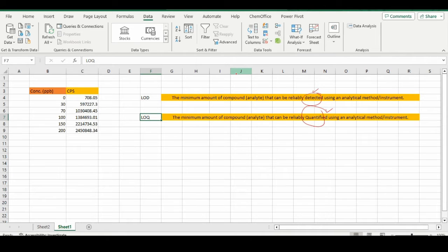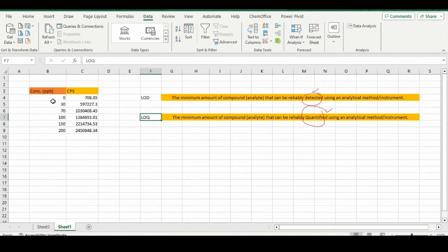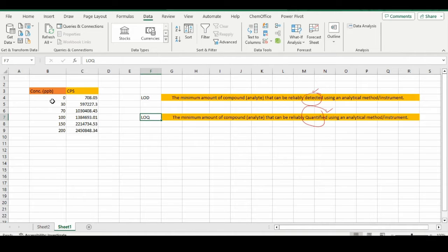In order to find out the limit of detection and limit of quantification, I have a dataset. This dataset is derived from real-time ICP-MS data. This is concentration in parts per million, and these are our CPS values, counts per second.